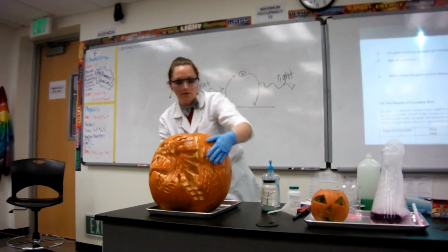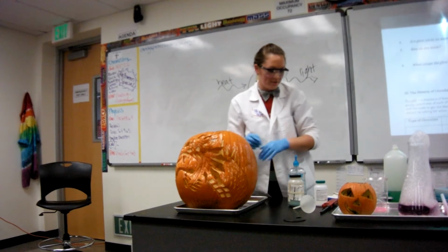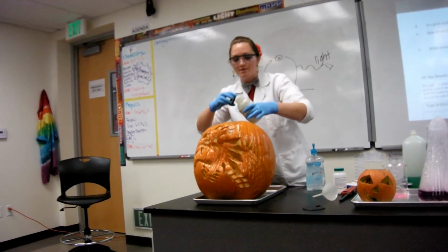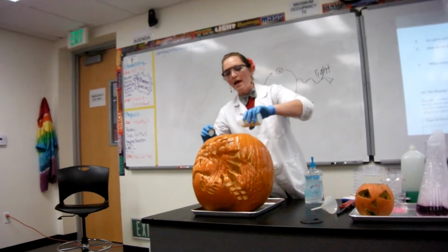Oh my god. I hope that's enough, because last time it didn't light on fire. So let's see if it works. And because we did the flame lab, I've thrown in some copper. So what color will the flame be? Blue. Oh! Green.